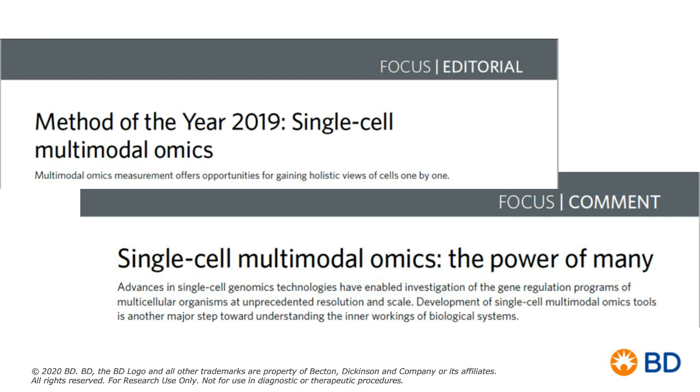One of the other key benefits that I like out of it is that it tells you precisely how many cells you actually captured. You may say, for example, load 20,000 cells, but in the worst case scenario, you only capture, say, 10,000 cells. Well, now you know to set your sequencing depth recommendations or expectations for half of what you thought, so you can save money that way.